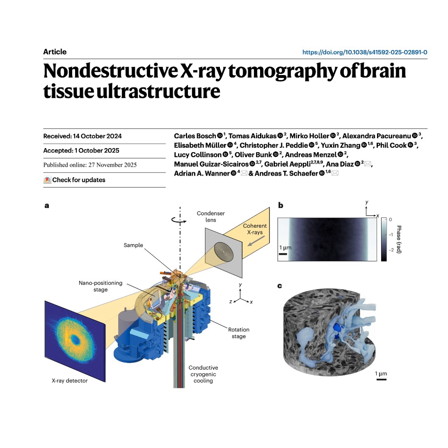Yeah. So a question for you then. We can see synapses, but what specific intracellular features, maybe things even smaller than vesicles, do you think would still be a challenge at this 38 nanometer ceiling? That's the right way to be thinking, what's next. So while we can see the overall synapse structure, things like individual synaptic vesicles. Little sacs of neurotransmitters. Exactly. Those are closer to 30 to 50 nanometers in diameter. So while you can see them as a cluster, the membrane of an individual vesicle might still be a little blurry. For that, you'd need to push closer to 20 nanometers. I see.